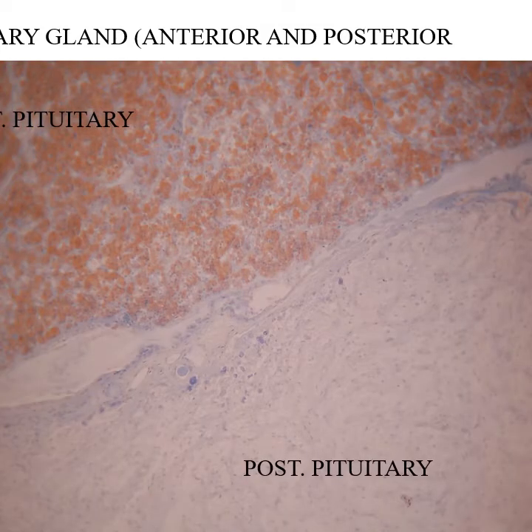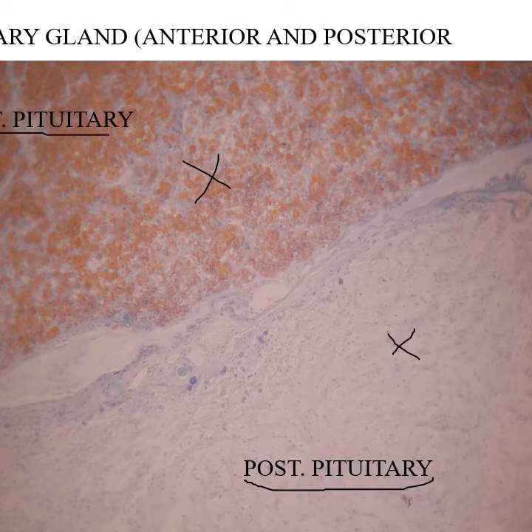All right, another pituitary slide. This is one we've rotated out of your boxes so you won't see it much. But over here, again, posterior pituitary. Again, it's lighter, more nervous tissue in it, mostly neurons. Well, it's all nervous tissue. Doesn't stain as well. Up here, kind of top left, that's the anterior pituitary. Again, more typical glandular epithelia.